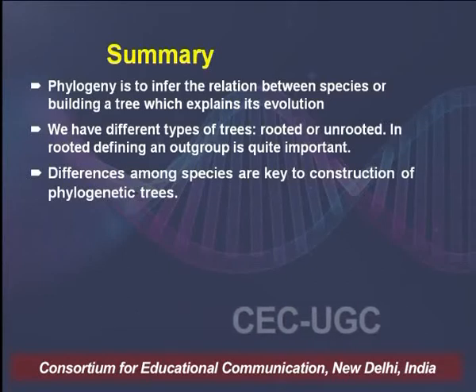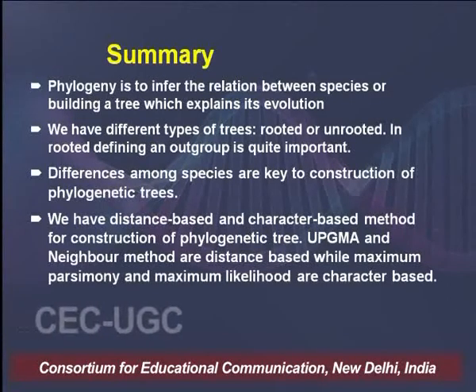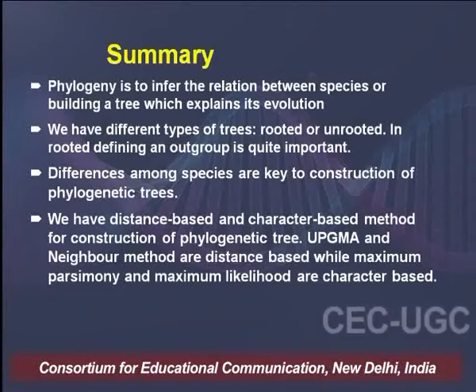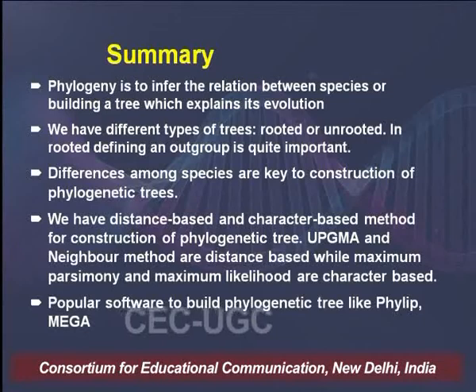building the tree. We have two types of methods for building phylogenetic trees. They may be distance based methods or they may be character based methods, and we studied all four methods with the help of MEGA software.